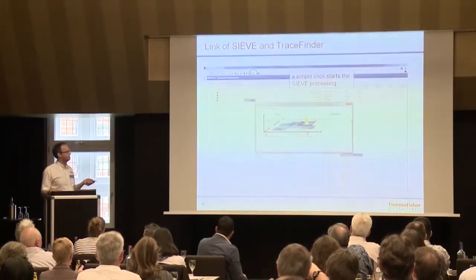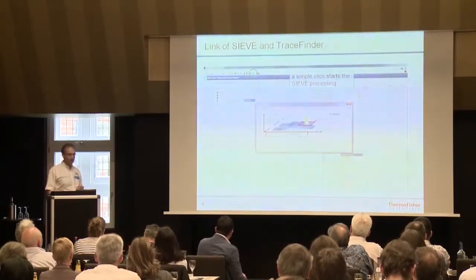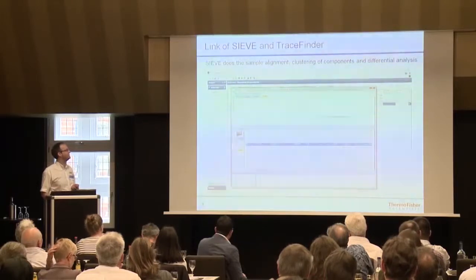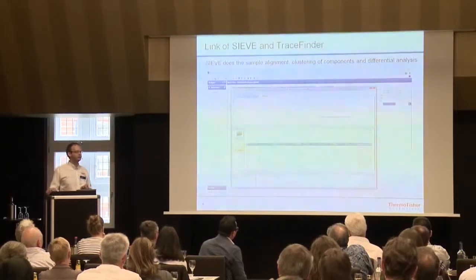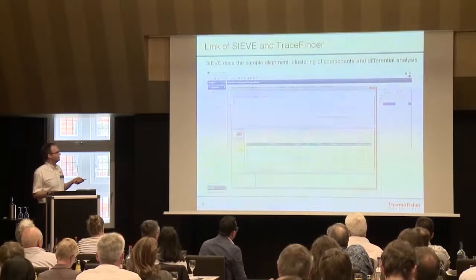And there's just a number of parameters left you have to set. For example, for the framing, you have to set a couple of parameters. But then, once this wizard, and it's a 3-step wizard, is finished, Sieve will come up, fully parameterized. You just need to click it, and then Sieve will do its job. So the outcome in the end should be something like that.